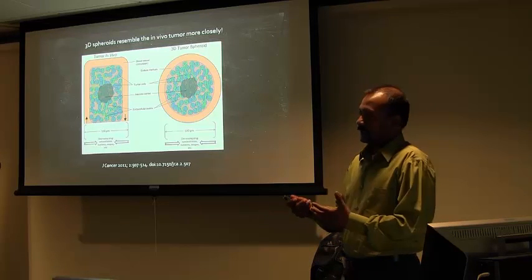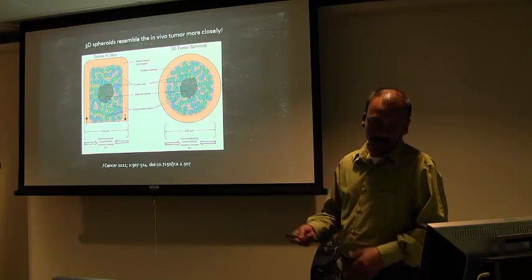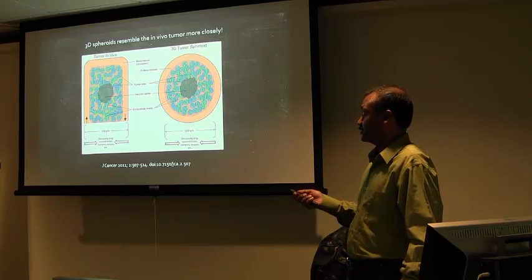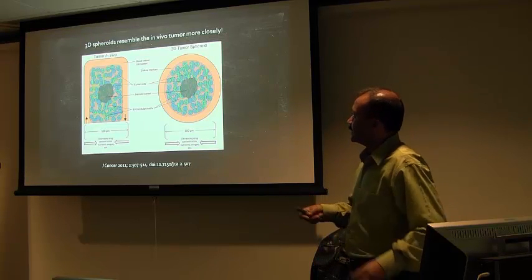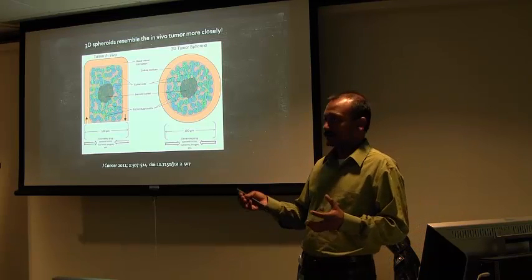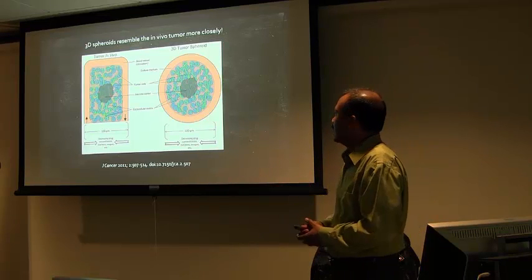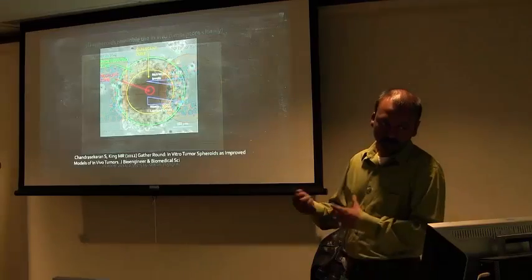Recently, culturing cells in 3D has become very popular, and many cancers have been cultured in 3D in high throughput format, in several different ways. I'll discuss all those different spheroid models in cancer, how they can be grown, and how they differ from one another. And I'll also share my experience in culturing spheroids as well.